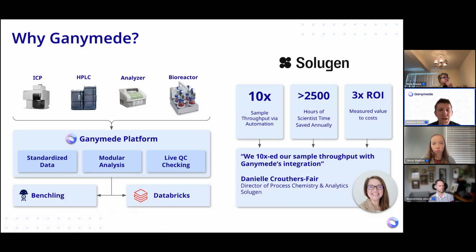We cleaned up all the data, and then we were also able to automate the data entry of the final results into Benchling, as well as automate all data movement from the raw data to those analyzed results into Databricks for them to do their own further downstream modeling. And this was very, very powerful for them because that automation both added a lot of scientific insight, but also saved them so much time.